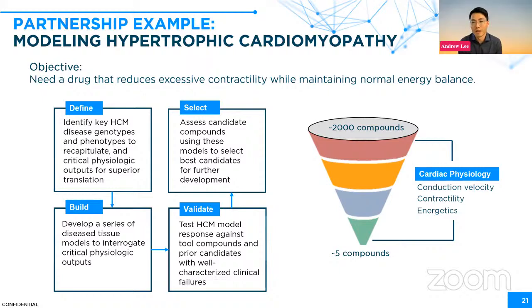Yeah, that's a great question. Currently our tissues are printed in 24 well plates, and that's where throughput really started to matter, especially when we're looking at screening against 2,000 compounds with a bunch of biological replicates that need to be understood. So we need to eventually move to higher throughput formats.